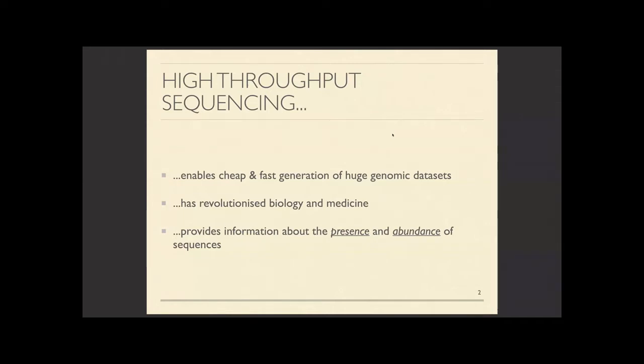So one thing that a lot of folks spoke about this morning was using long read or short read or both technologies to figure out who's in the community, in terms of maybe metagenome assembled genomes, and figuring out sort of what's present. So this talk is going to be focused on analyzing the abundance of microbial strains or taxa in a community.